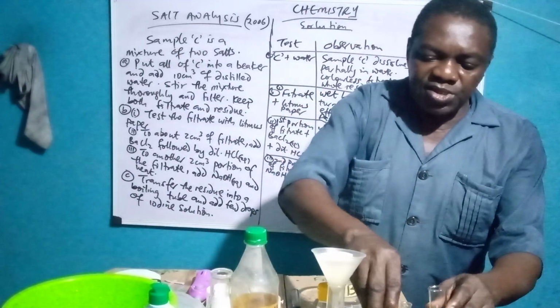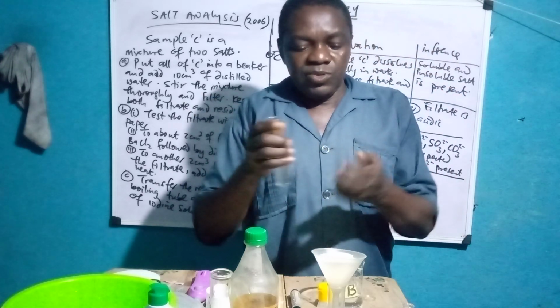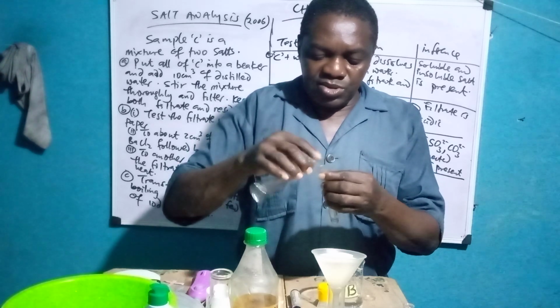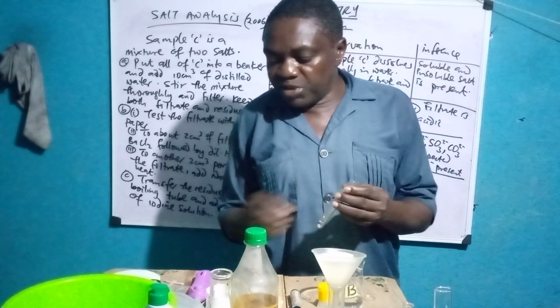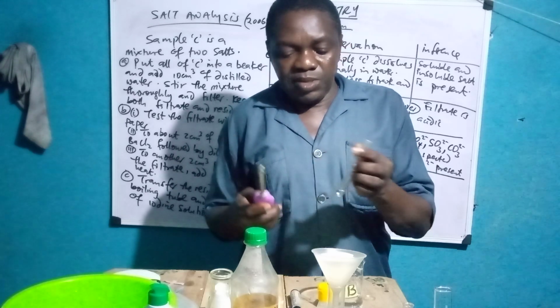So you take filtrate again. You can use normal situation. You have to use test tube holder. You can use either of them to heat. The heat generated is not strong enough. But when you're actually heating, you have to use your boiling tube. This is what you use to bake. It doesn't matter, but all that is necessary, I use boiling tube. Use a test tube holder. So this is what we are going to improvise for this work. Let's see how it goes.